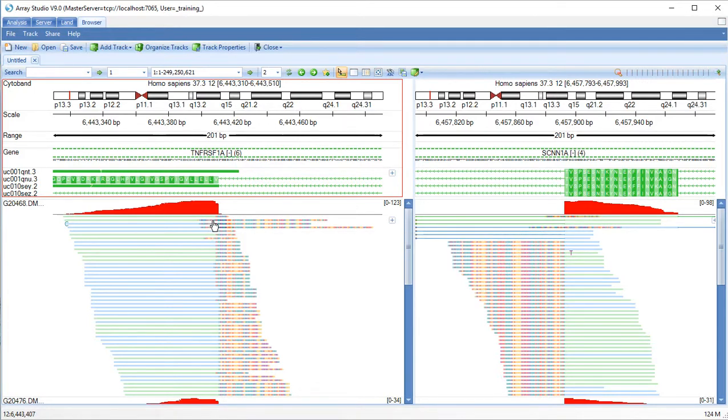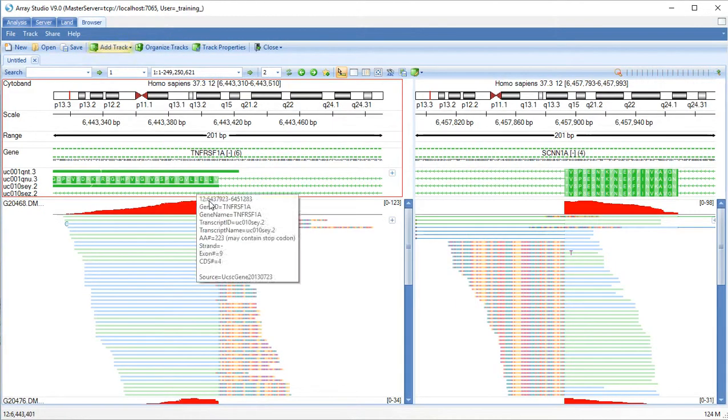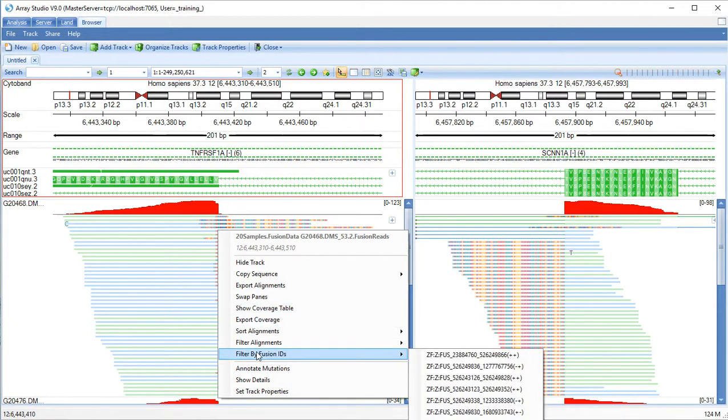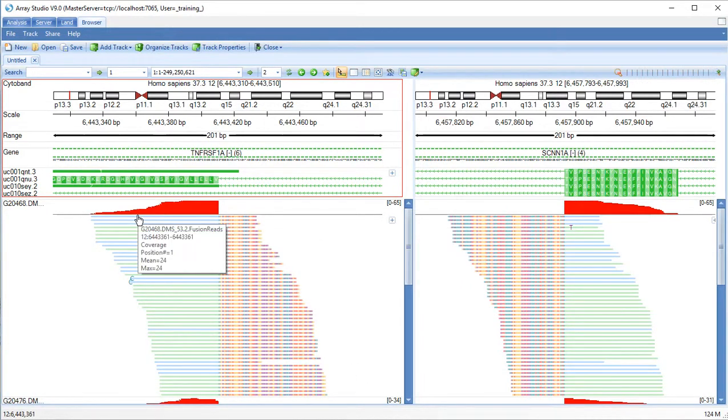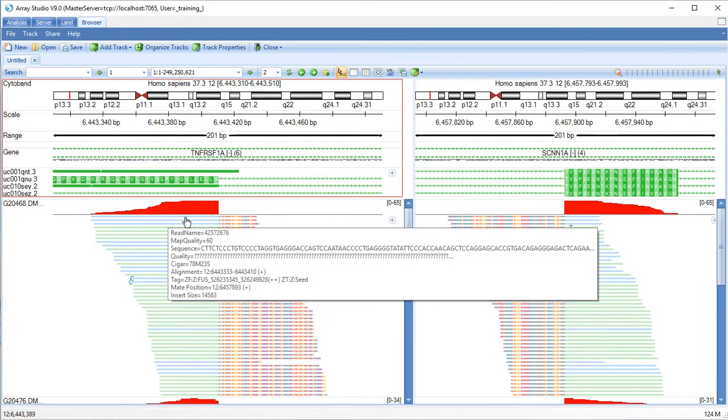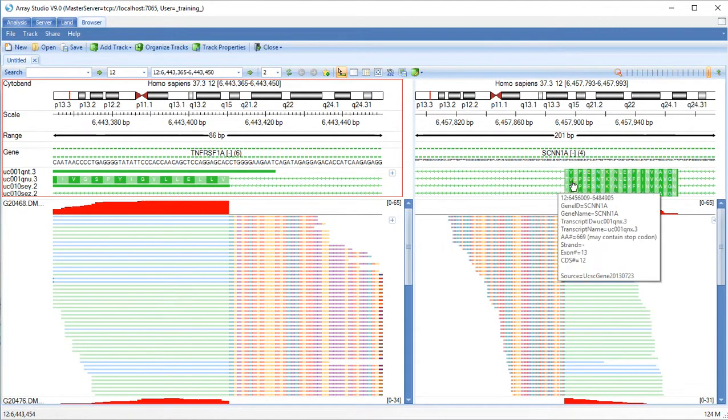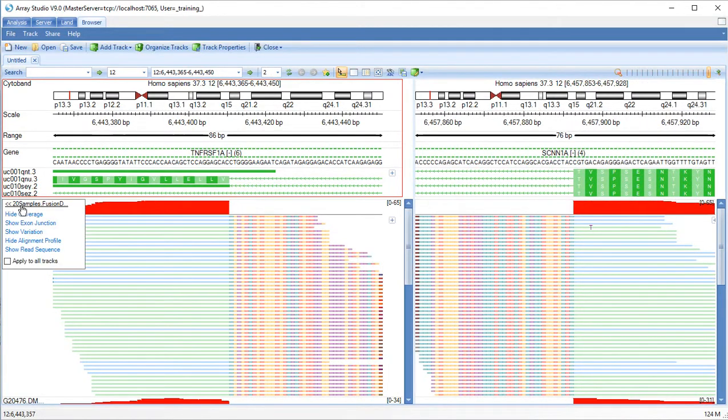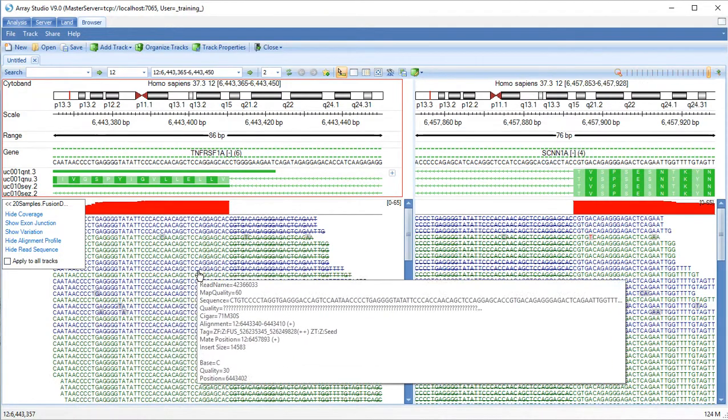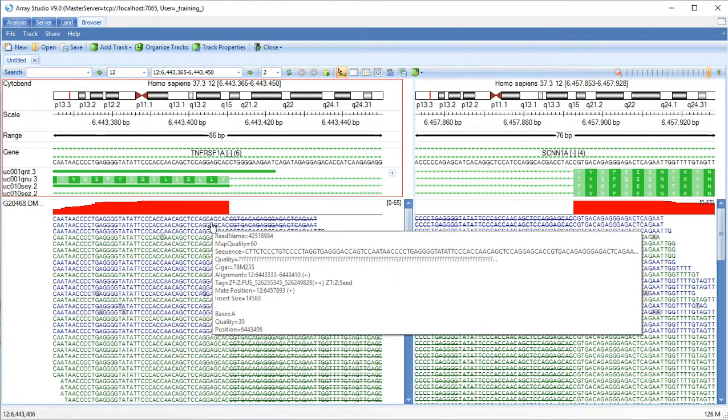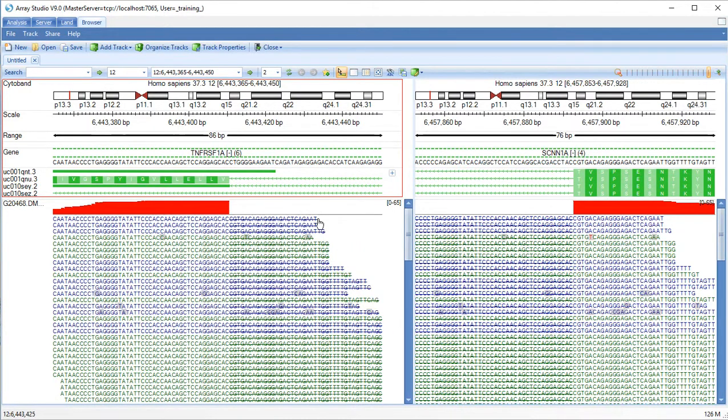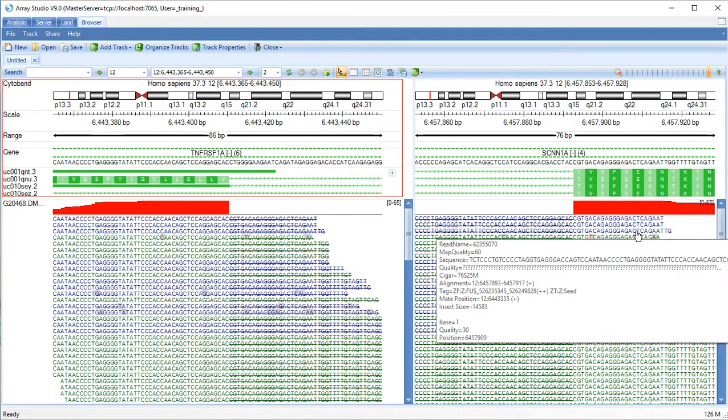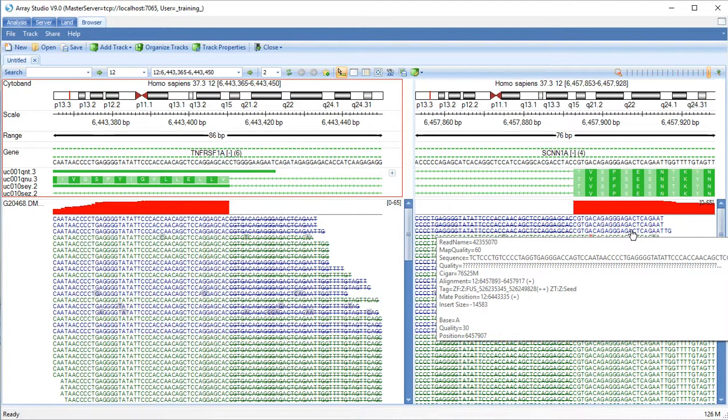We can filter by our fusion ID. Let's zoom in and look directly at the read sequence. We can see that these reads mapped partially to this gene, but do not match here, but this part mapped to SCNN1A. These three reads in blue would be considered to map to two unique cutting locations.